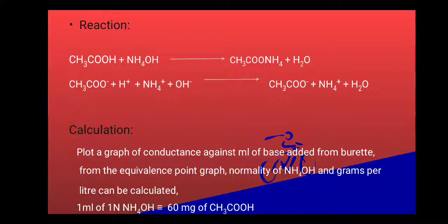I think from this video you are able to learn the measurement of conductance to get the endpoint for the different acid base titrations.